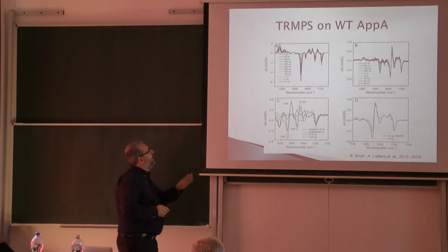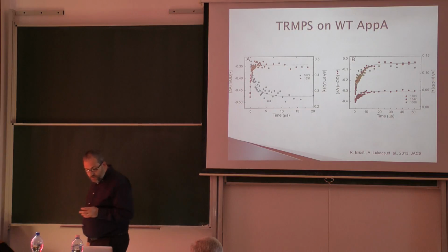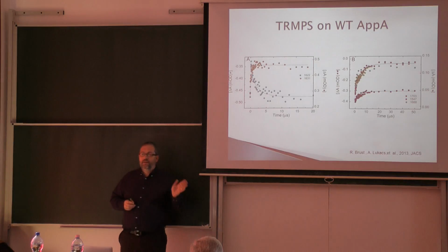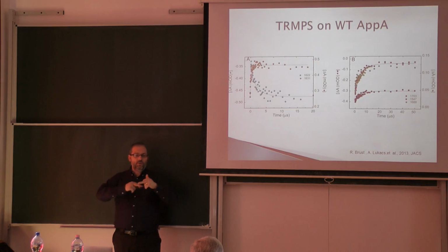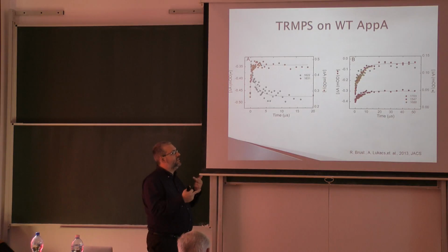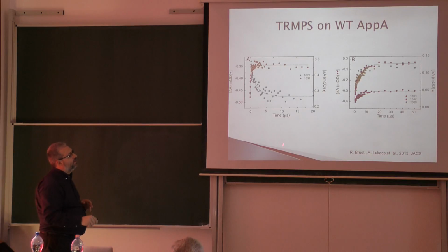Now let's jump. We had plenty of results on this, but we don't have time to explain it. But the idea is that we saw very nice decays and very nice protein dynamics on the microsecond scale, which proves for us that in APA, the original excitation, the original hydrogen bond reorganization which happens on the picosecond scale, triggers a larger conformational change, a larger change in the protein on a time scale of a couple of microseconds.